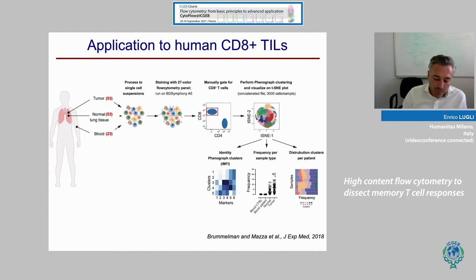So at that time, we started a new approach of data analysis. We thought that it was not necessary to analyze the data in a classical way anymore. So not doing all the manual gates that were required to identify populations, so, for example, double positive for some markers and then negative or positive, by using binary gates. But we isolated the population of interest. In that case it was CD8 cells. And we got CD8 cells from all the individuals and all the samples that we ran. So this makes more than 120 samples. And we combined all these CD8s into a single huge file by taking 3,000 cells per sample. And we computationally barcoded them, so we knew what file was corresponding to which barcode. So computationally, we could also go back and have a look at the original data.